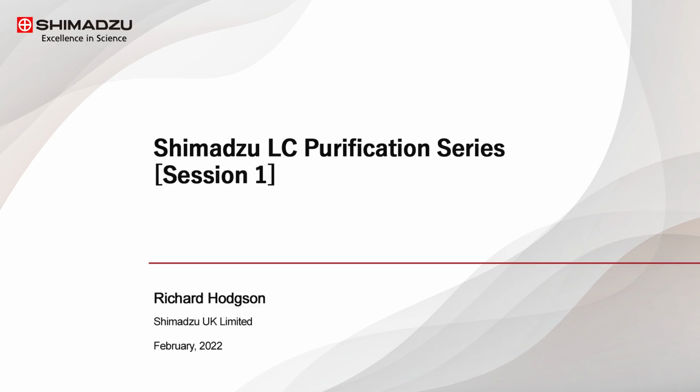This series of webinars is designed to introduce and increase your knowledge in this area. The first session in this series is looking at the fundamentals of LC purification.